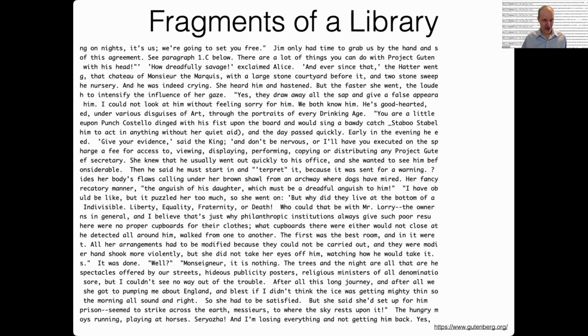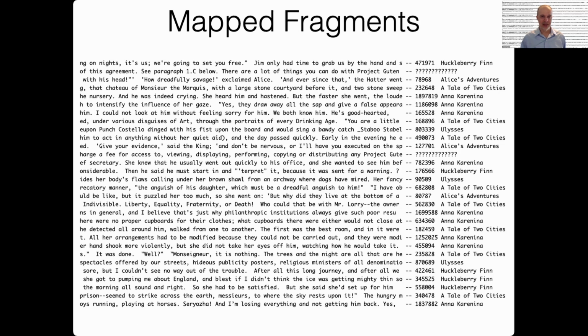They're more complicated. I'm not going to go into exactly how you would do that, but you don't need to worry about the more complicated ways to do that because other people have figured that out. If you care about that, I can point you to resources for faster ways to do the search. But just imagine, we're going to take each of these fragments, search the database, and then label the fragments with the book that the fragment came from. And so that's going to get us to this.